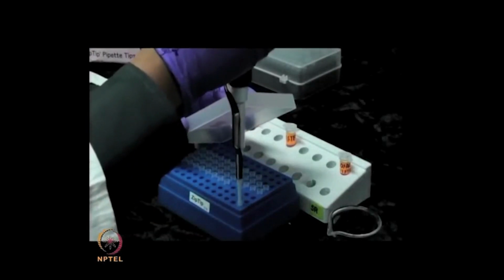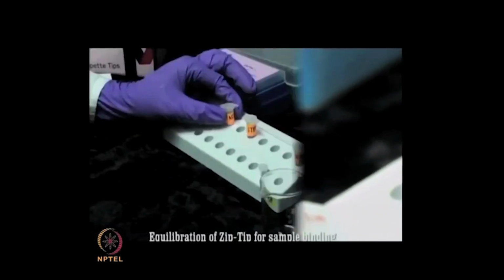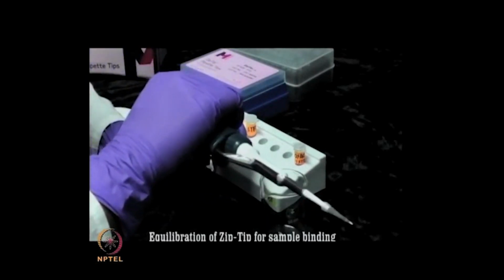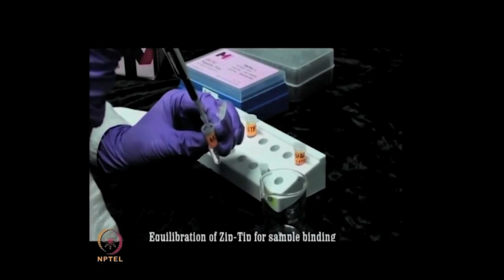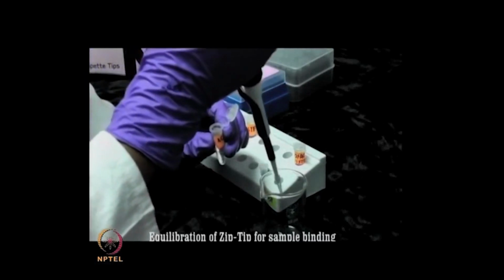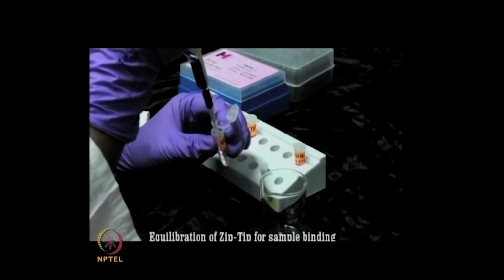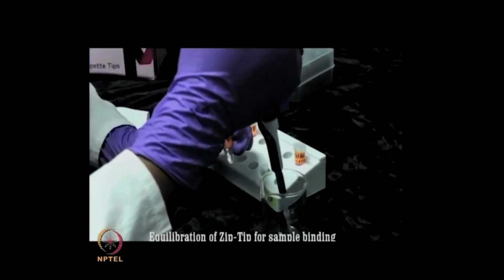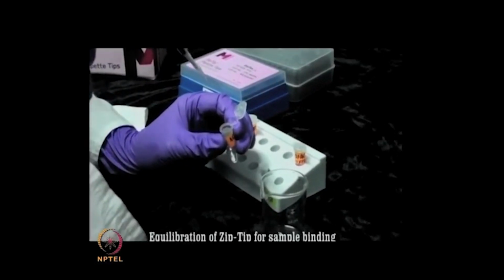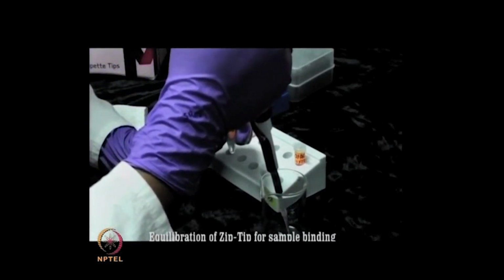The in-gel digested protein samples are further processed by using zip tip pipette tips, which contain C18 or C4 media for enrichment of peptides prior to MS analysis. A zip tip pipette tip is a 10 microliter pipette tip with a bed of chromatography media fixed at its end. It is used for concentrating and purifying peptides as well as removing salts, detergents and interfering agents.